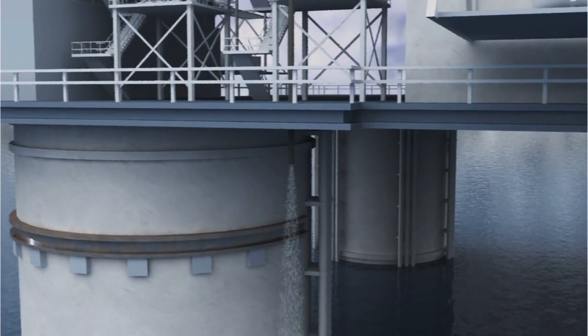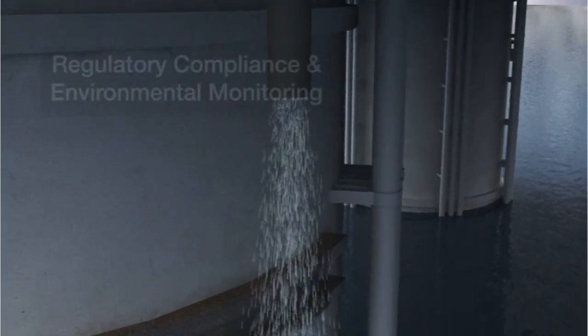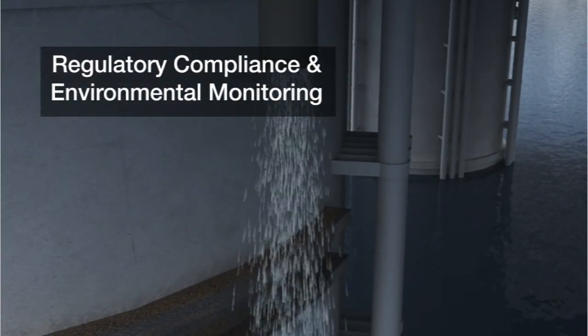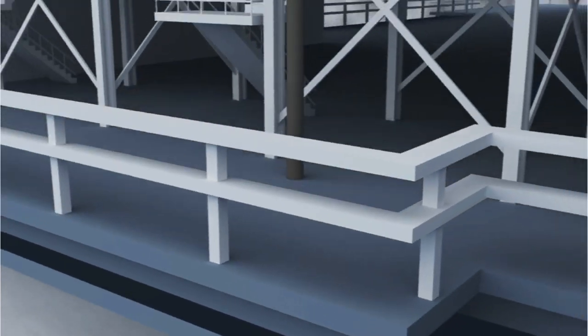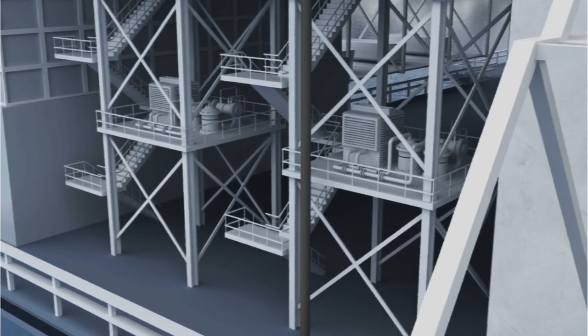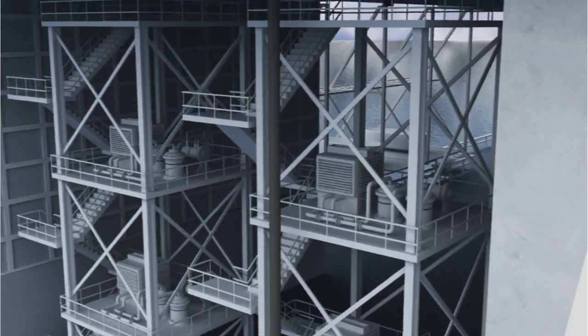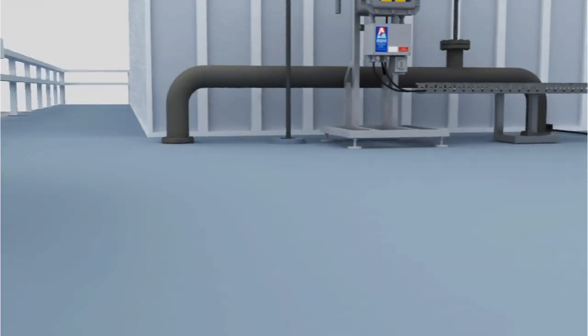Overboard discharge measurement has always been a requirement both for regulatory compliance and environmental monitoring. However, in the past issues have surrounded product accuracy, reliability, and the need for operator intervention to keep monitors clean.